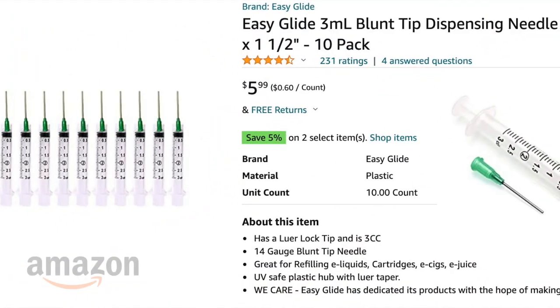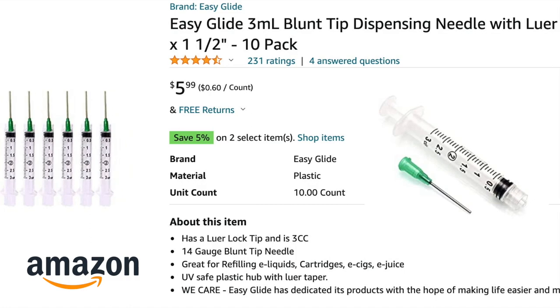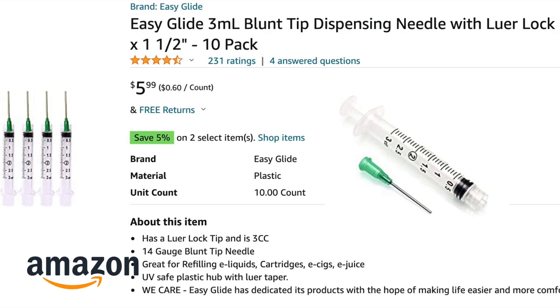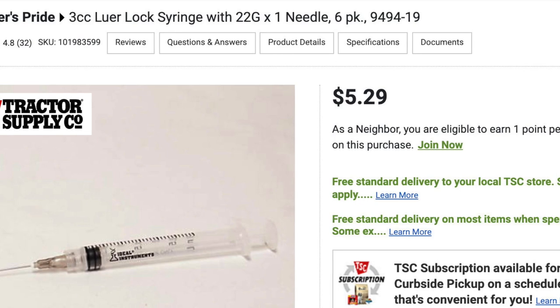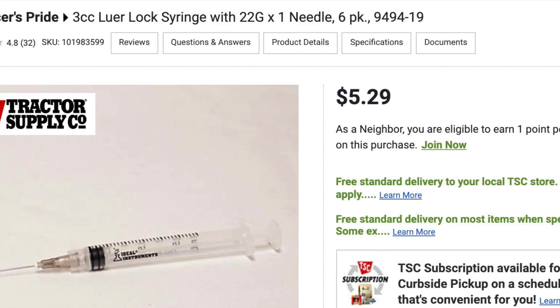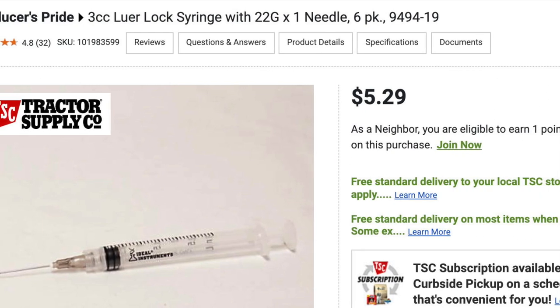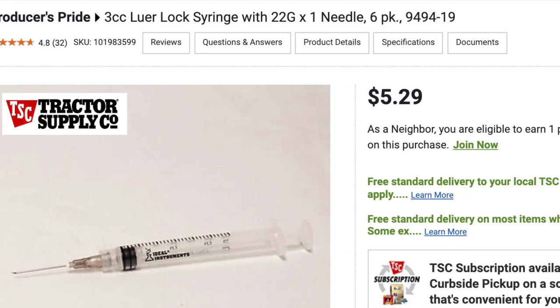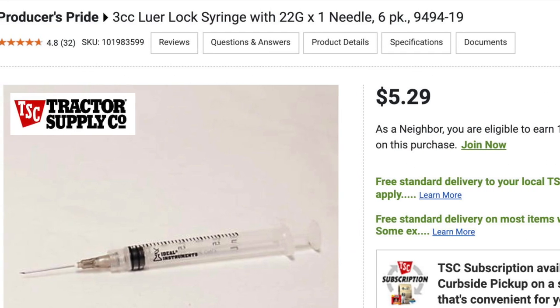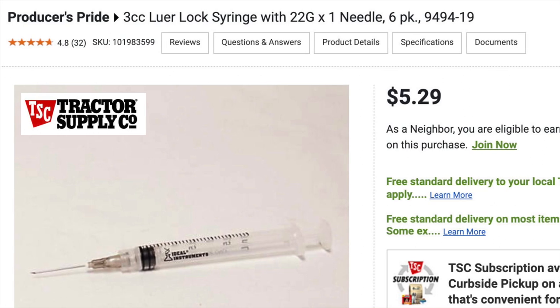The first thing you will need to make a spore syringe is a sterile syringe. These can be found on Amazon — just make sure that you get one that's sterile. I'll put a link in the video description. You can also find these at Tractor Supply. Blunt tips are fine and will be used in this video, but sharp tips have a small advantage as they are easier to poke through polyfill or myco bags. Note that if your syringe is not sterile, most can actually survive a pressure cooking without melting, so that is also an option.